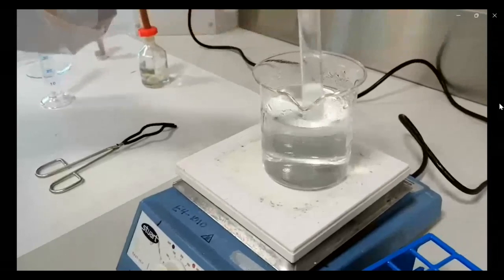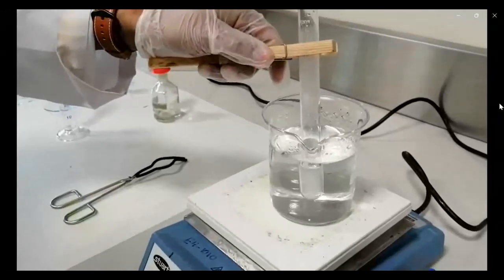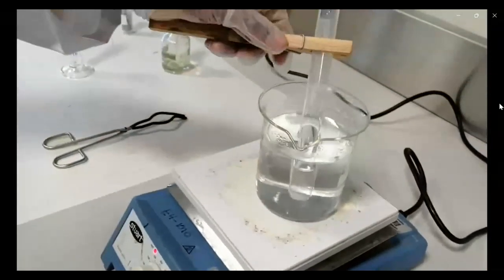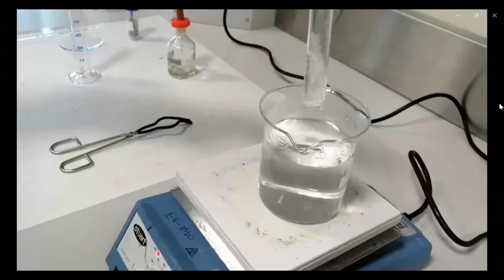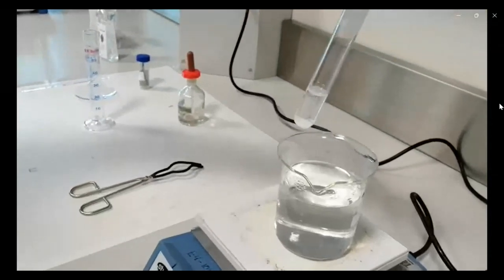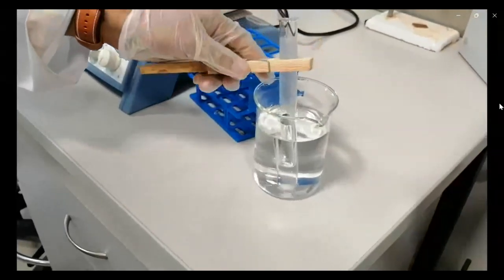So the solution becomes clear. Can you see that? Just wait some time and put it in the water bath. Can you see it become very, very clear with heating and with time? Which means the lead chloride is dissolved on heating. If you put this test tube in cold water, you will see the precipitate formed again.